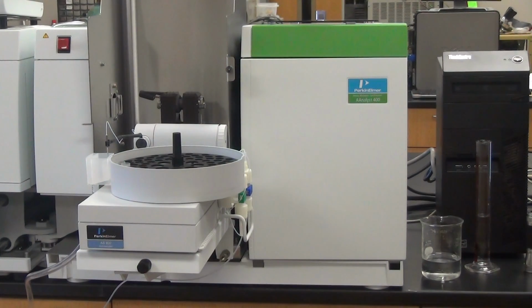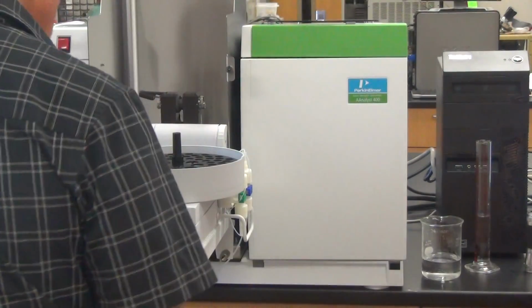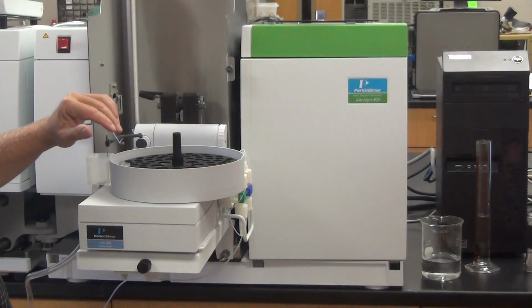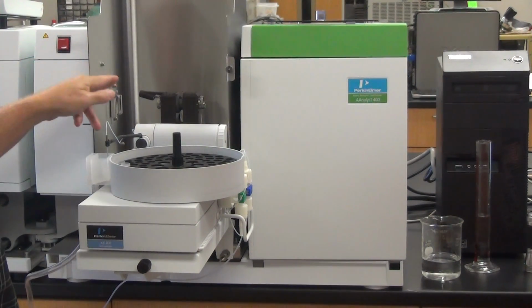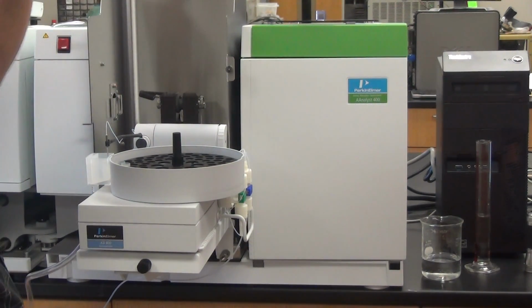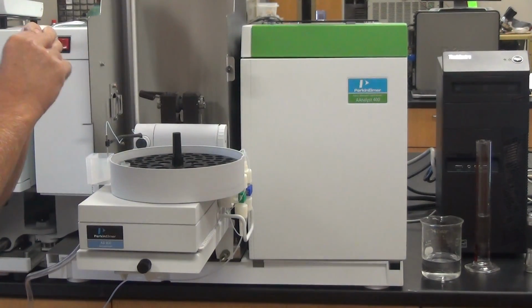So at this point, everything is aligned. Do we have to go through that whole alignment every time? No, because we've got it aligned. Even when we swing it out and swing it back, it is still aligned. As long as no one's hit this, you should check every time. You should probably pull out the windows and look at them, make sure they're clean.